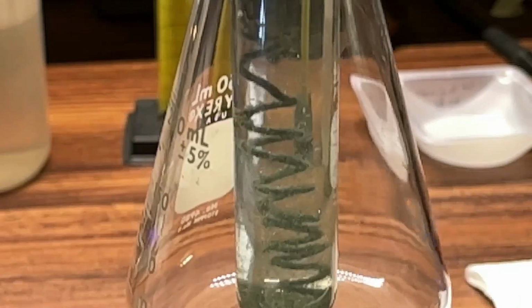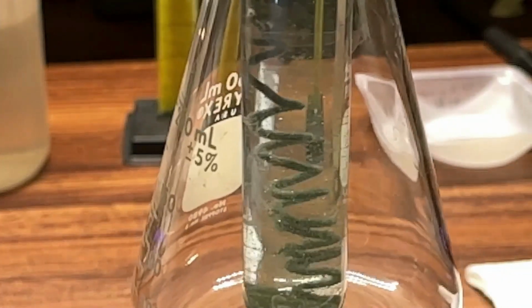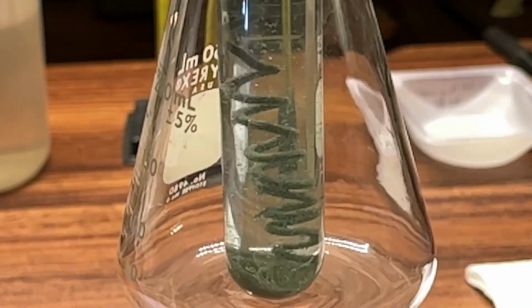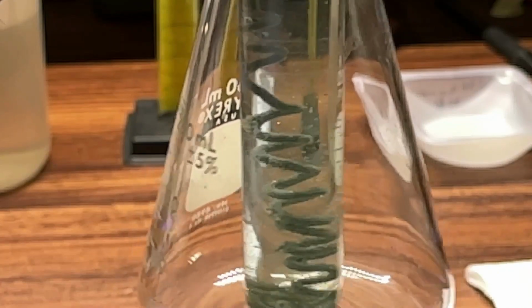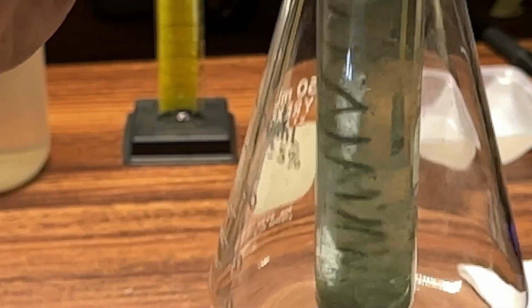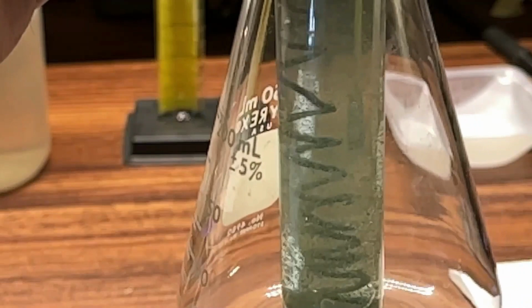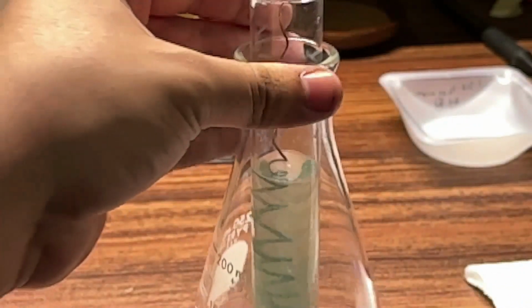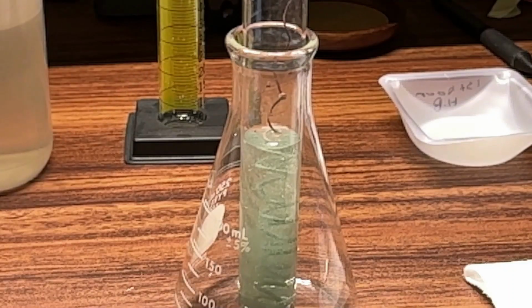And remember, the reason that I'm doing that is because if I don't, and I just let the silver build up, eventually the silver will cover up all of the copper, and then the copper is not making contact with the solution. So that will actually prevent the reaction from happening, because the copper needs to be making contact with the solution. So I'm going to keep shaking that every, I don't know, 2 or 3 minutes just to re-expose the copper. But other than that, I'm going to let it sit for a while.